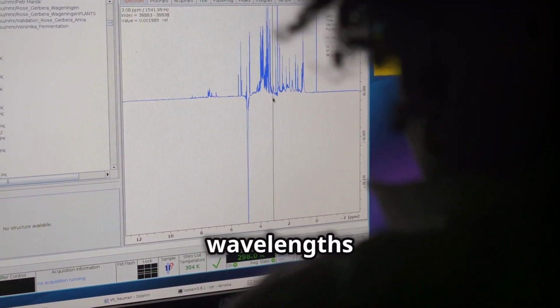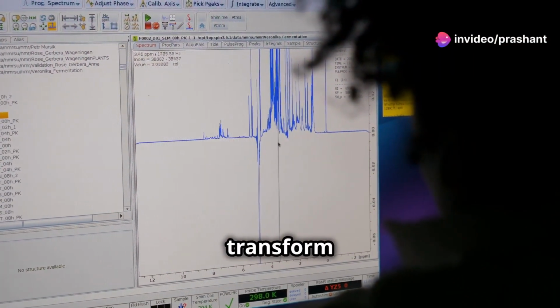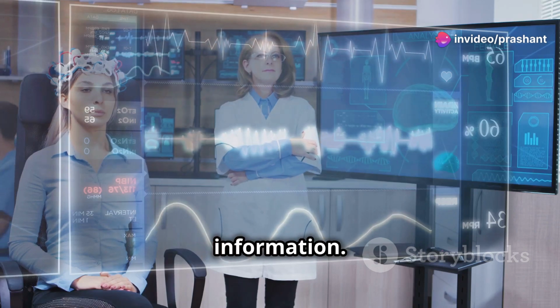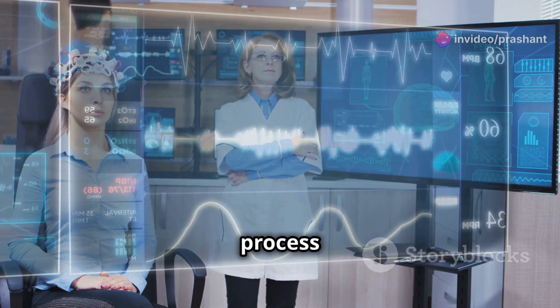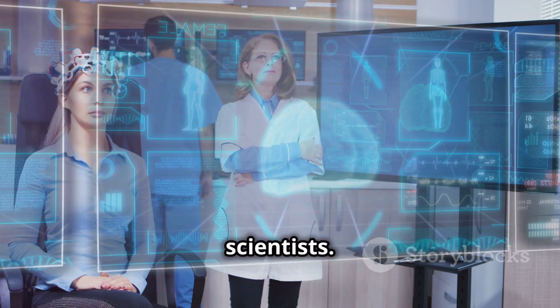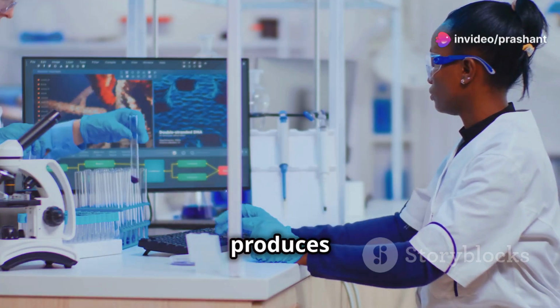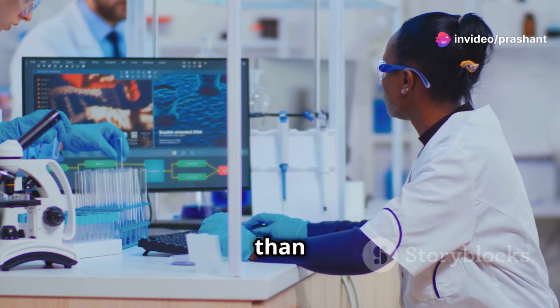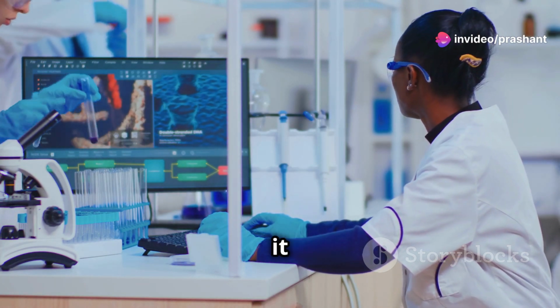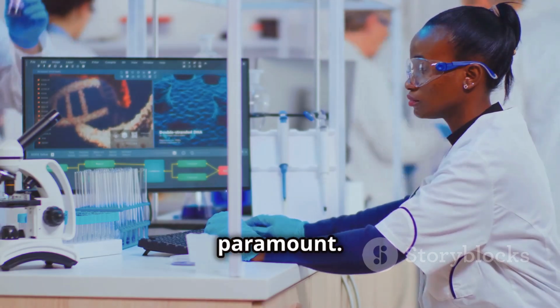It measures all wavelengths simultaneously and uses a mathematical trick called a Fourier transform to decode the information. This mathematical process converts the complex data into a spectrum that can be easily interpreted by scientists. FTIR is faster, more sensitive, and produces higher resolution spectra than dispersive IR. This makes it an invaluable tool in modern laboratories where speed and accuracy are paramount.